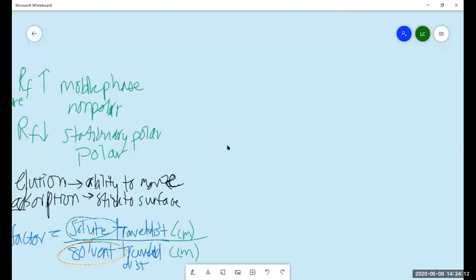Okay, if you see page 33, they do give you a distribution of different affinities, in a sense, elution power. Affinity is what you like to interact with.